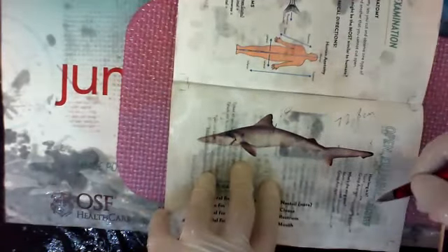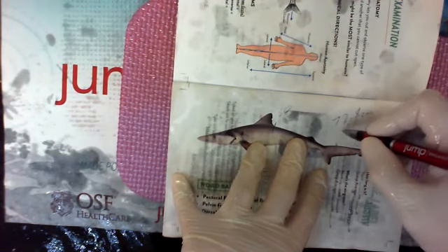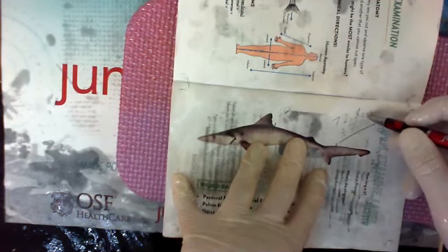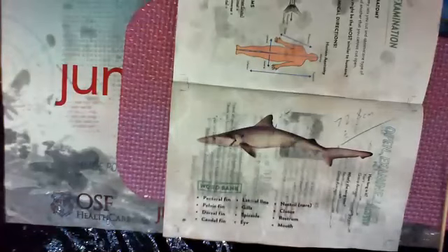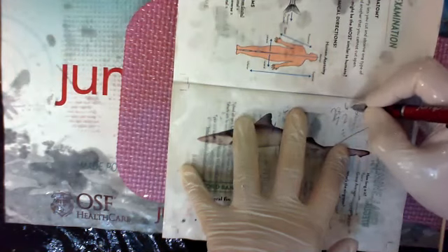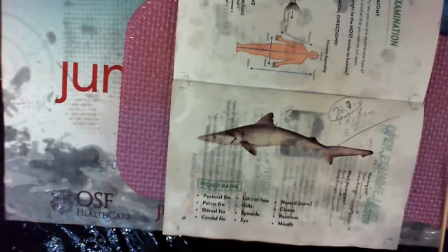To find out how many inches, you can measure again, but I just use a calculator. I usually have somebody around with a calculator if they walked out the door. But anyway, we divide this by 2.54. So for every 1 inch, there's 2.54 centimeters in it. Echo. What is 72.8 divided by 2.54? 72.8 divided by 2.54 is... There, you heard it. 28.66 technically, so 28.7 inches. Echo bosses me around at work and at home, but she's also very helpful. So 28.7 inches. That's my overall length.